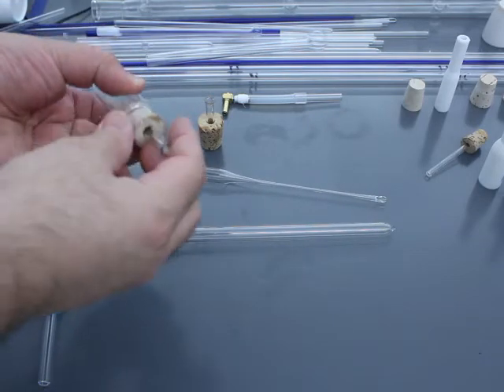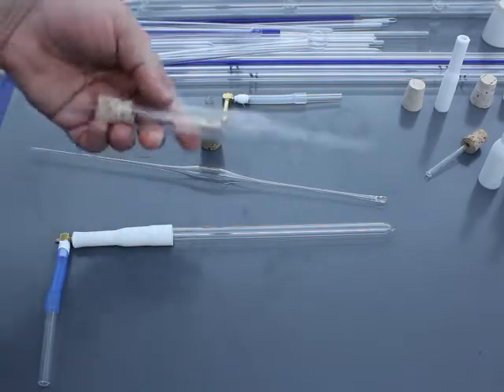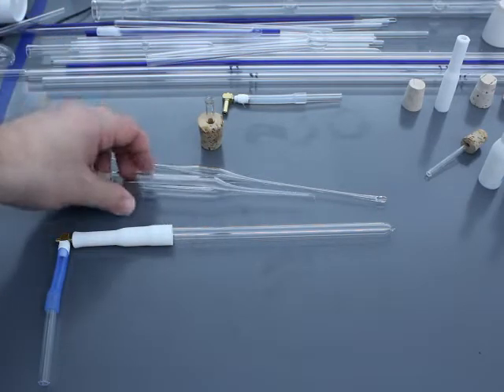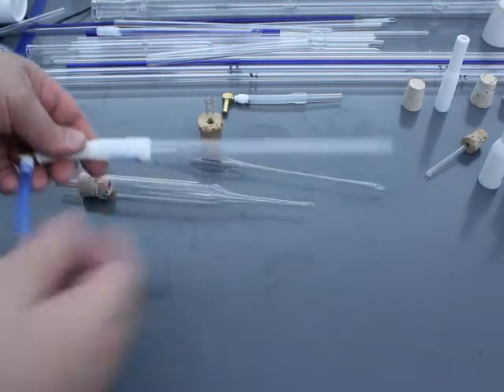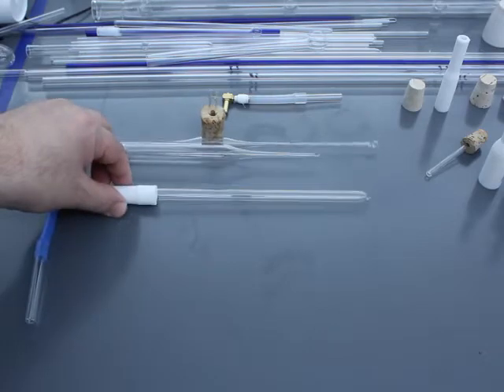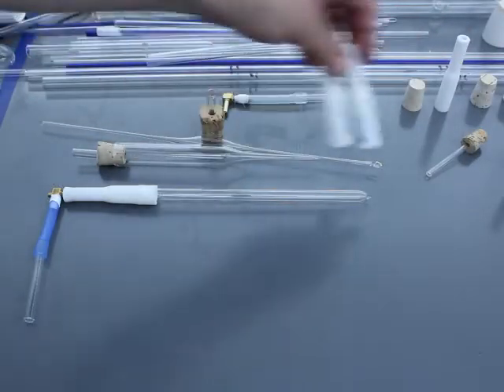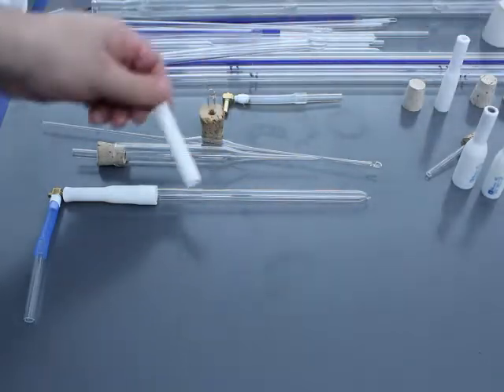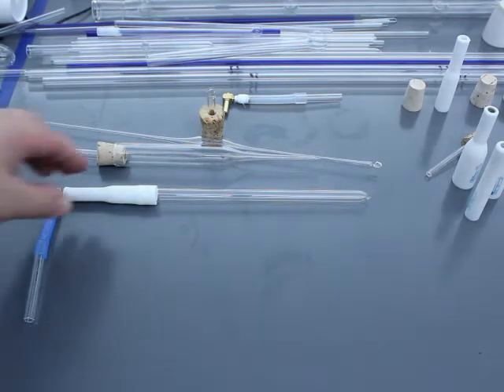This is sealed here. We've got a cork, and it's got a piece of glass tubing in it. You'd put your blow hose here, heat, and then blow. And then we've got the new silicone adapters, which basically seat right onto the glass tubing that you're going to use. And they come in different sizes for the different diameters of glass, even down to 10 millimeter.